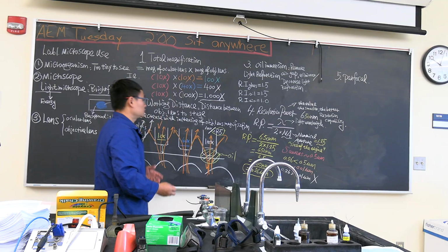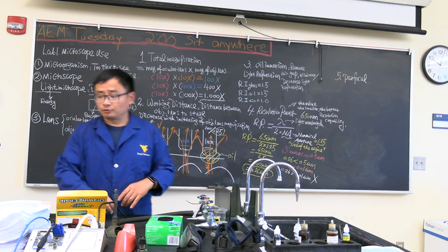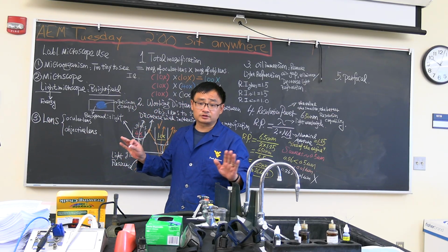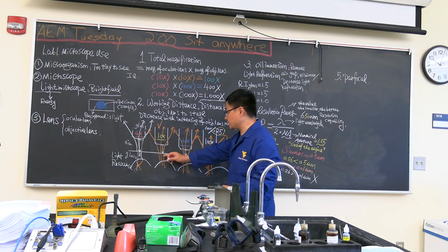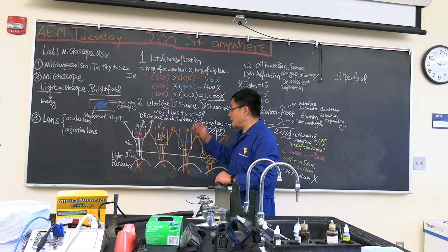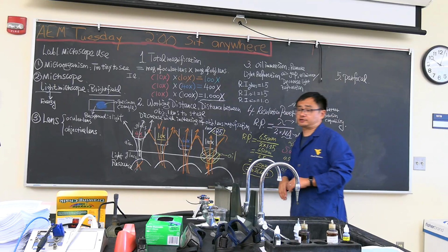So this gives you another terminology. We assume this microscope is functional, in good status. Once you use 10x to find the specimen, then you add 1 drop of oil, switch to 100x.